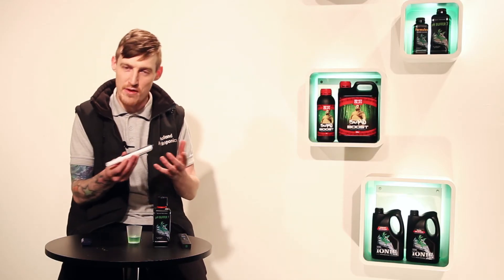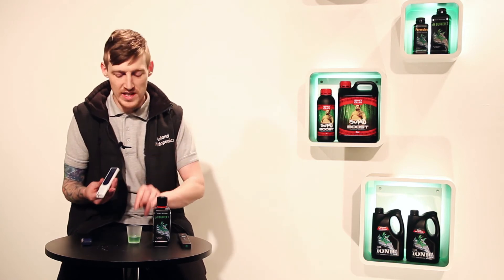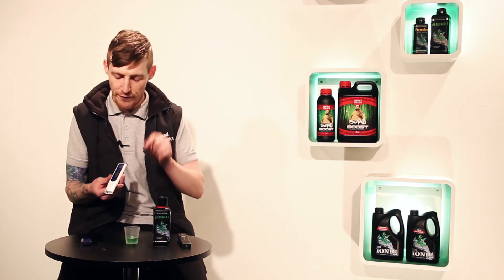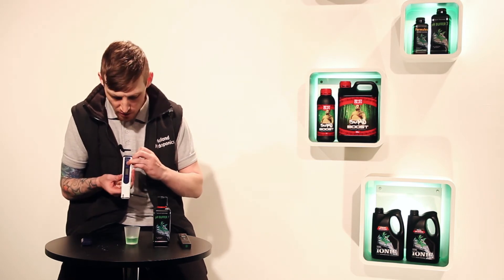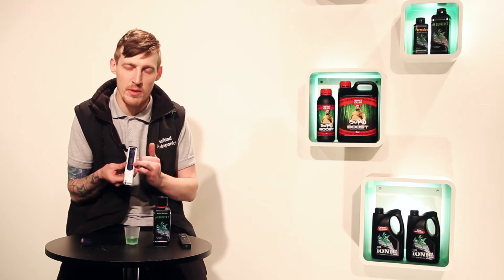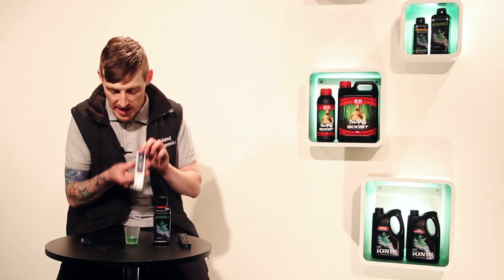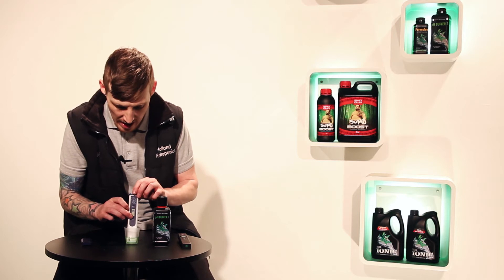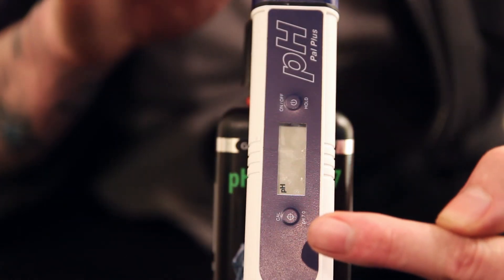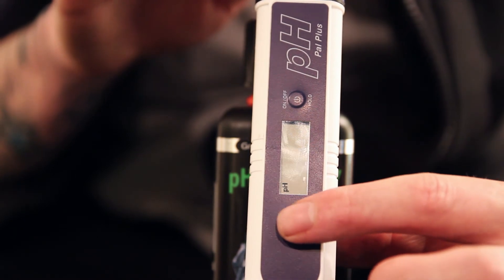Moving on to the more higher range pen. The principle is exactly the same when it comes to the buffer solution — into a little measuring cup, a quarter full. You turn the power on at the top. This one has a little button that says CAL on it, which means calibrate. First of all, you put the pen into the solution. The calibrate button — you want to press that for about 2 seconds until you see the words CAL on the screen.